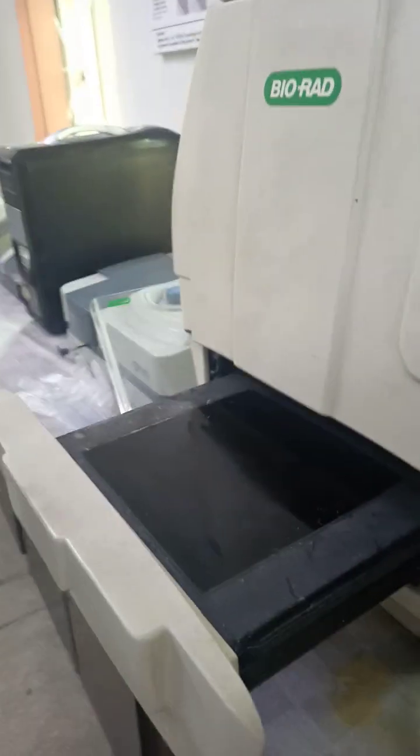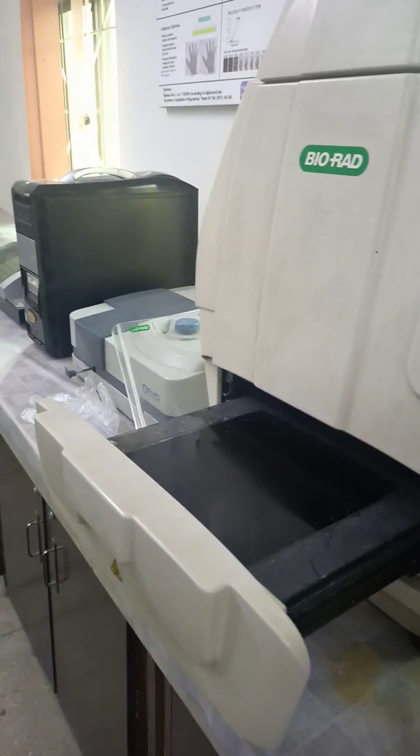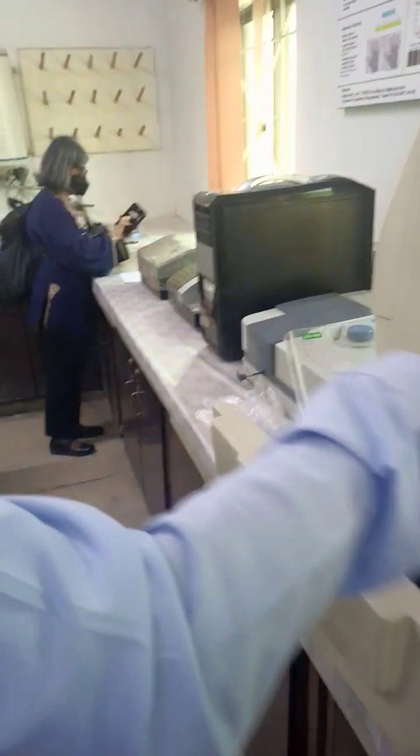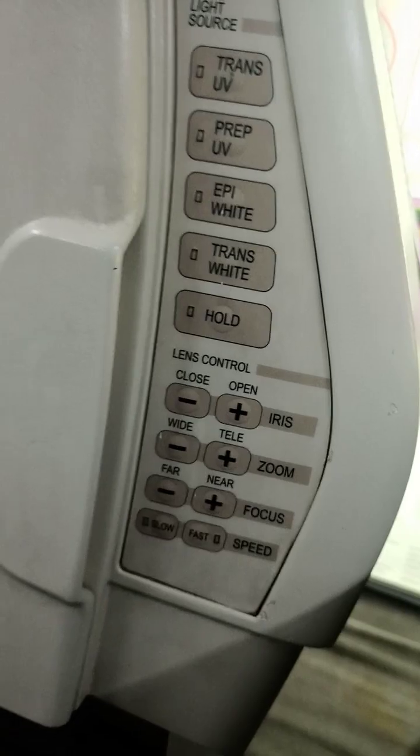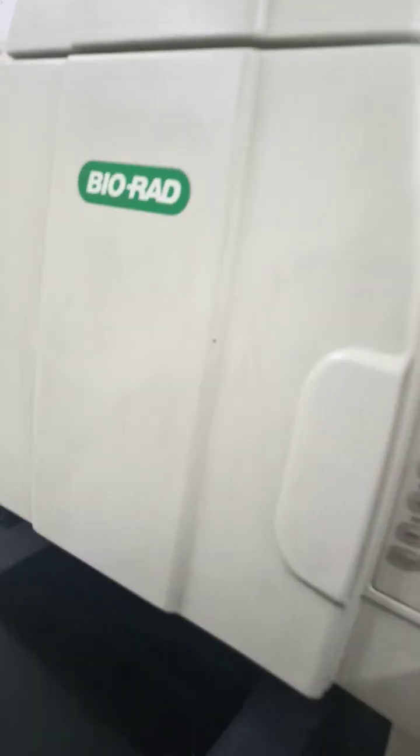Yes, this is the gel documentation system. This is a Bio-Rad one. It's a very good one. Here is the UV source. We put the gel here and just put on the UV light. You get the image of the gel, showing whatever DNA has been amplified. Yes, we can photograph it in the system.